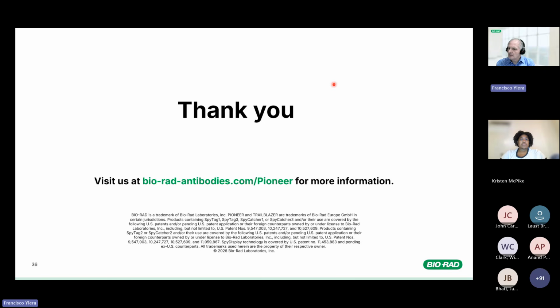The second question, what was it? Nanobody libraries? What's your opinion on synthesis nanobody sequences in the target validation? Yeah, nanobodies are actually a newer class which gained a lot of attention in the last, I don't know, 5 to 10 years, both for target validation and tool antibodies as well as for therapeutic antibodies.